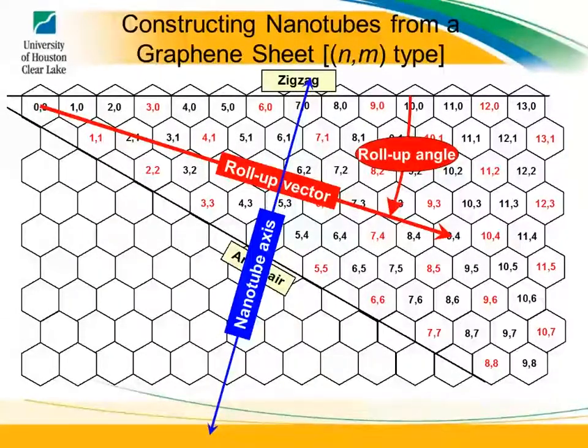Every nanotube here that's in red is a metallic nanotube. And you can identify different nanotubes by the n,m number. So 7,4,8,5 would be metallic nanotube, whereas everyone that's in black is a semiconducting nanotube. How you can figure out whether it's metallic or semiconducting is subtract n and m from each other, divide by 3. If you don't get a remainder, it's a metallic tube. If you get a remainder, it'll either have a remainder of 1 or 2, so you have mod 1 tubes and mod 2 tubes. Mod 1 and 2 are both semiconductors, but they behave differently under strain. One shifts one way, one shifts another way. I'll discuss that. Metallic tubes do not have a band gap and therefore are not semiconducting, and they do not fluoresce.